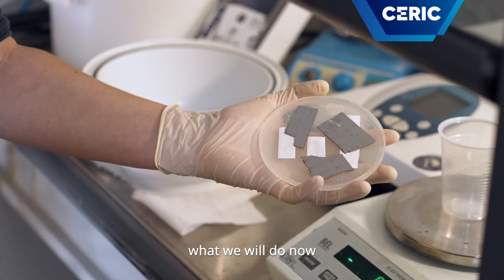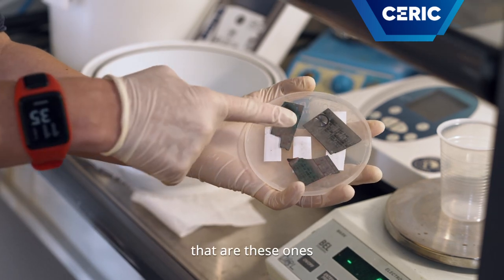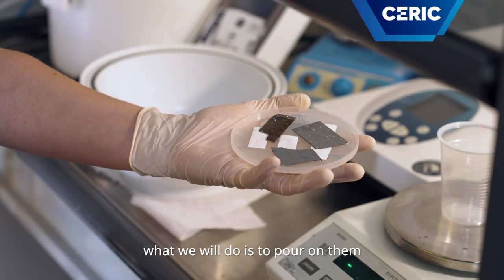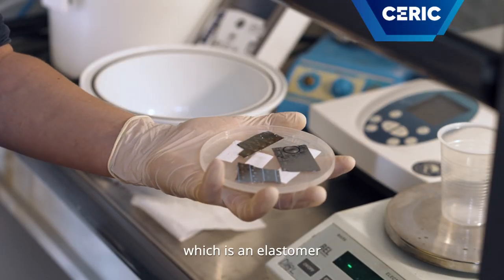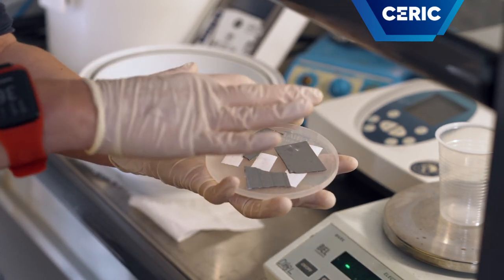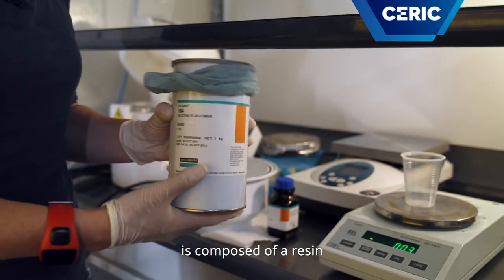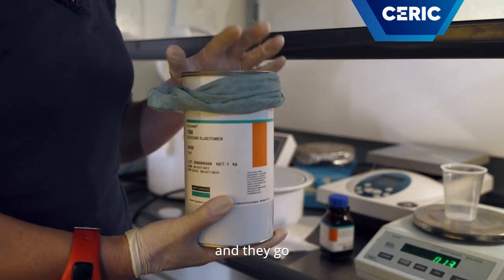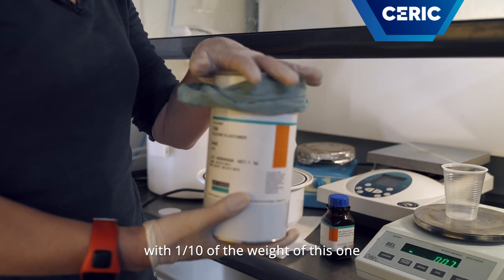What we will do now is the replica of some microstructures — these ones made with optical lithography. What we will do is pour PDMS on them, which is an elastomer, and it will replicate the structures of the sample. PDMS is composed of a resin and a curing agent, and they go in a ratio of one tenth the weight of the resin.